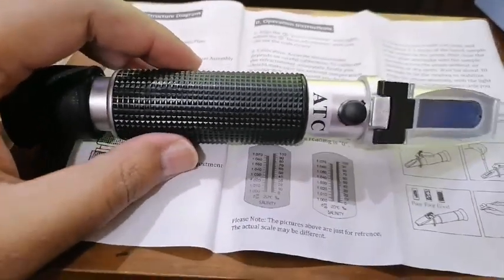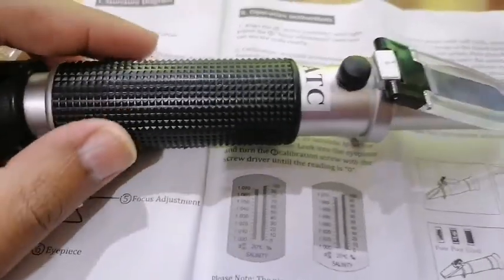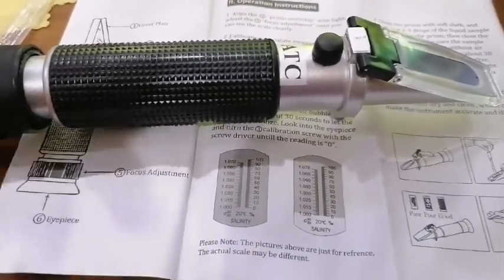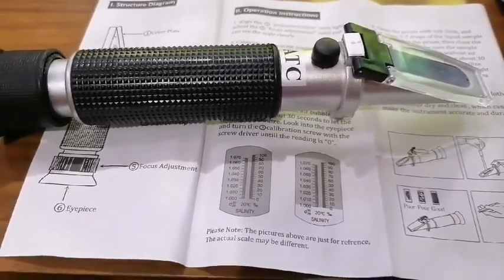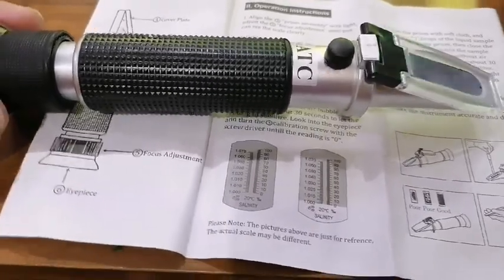First of all, I am going to tell you how to calibrate it. For the first time you need to calibrate it, because some refractometers are already calibrated and some are not. But for the safe side, you must calibrate it.